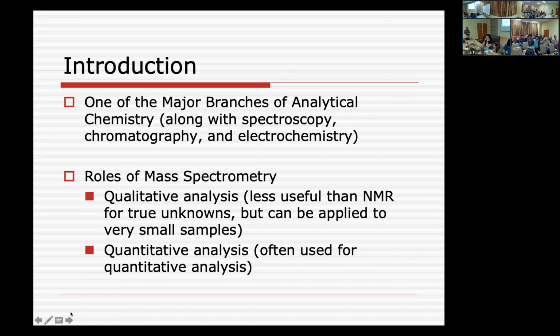Nah, untuk keperluan elusidasi struktur biasanya kita kombinasikan dengan NMR ya. Tapi MS ini sangat efektif untuk digunakan pada sampel yang sangat kecil, seperti trace element pada obat, untuk membedakan pestisida, bisa kita manfaatkan dengan spektroskopi massa. Kalau NMR itu perlu kita isolasi, kita harus mendapat isolat baru kita start identification. Tapi dengan MS ini kita bisa menentukan sampel itu secara langsung, karena kita bisa mengetahui pola fragmentasinya.